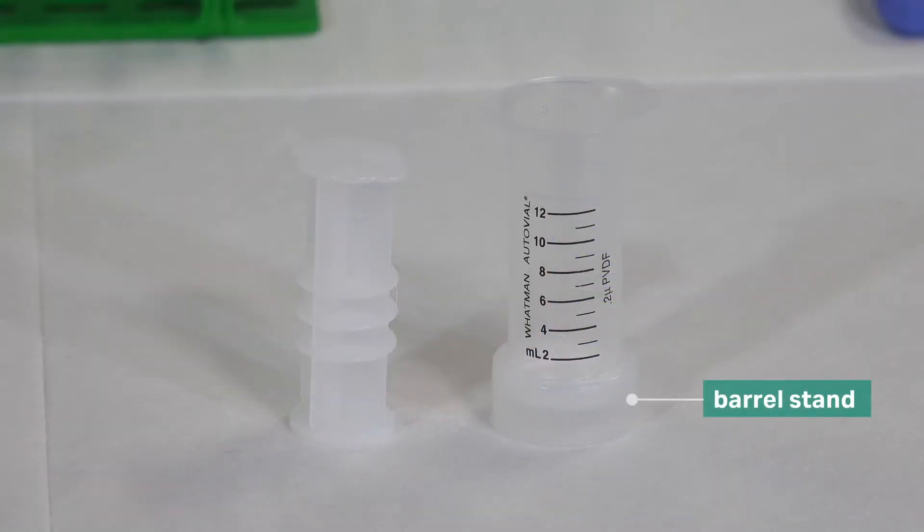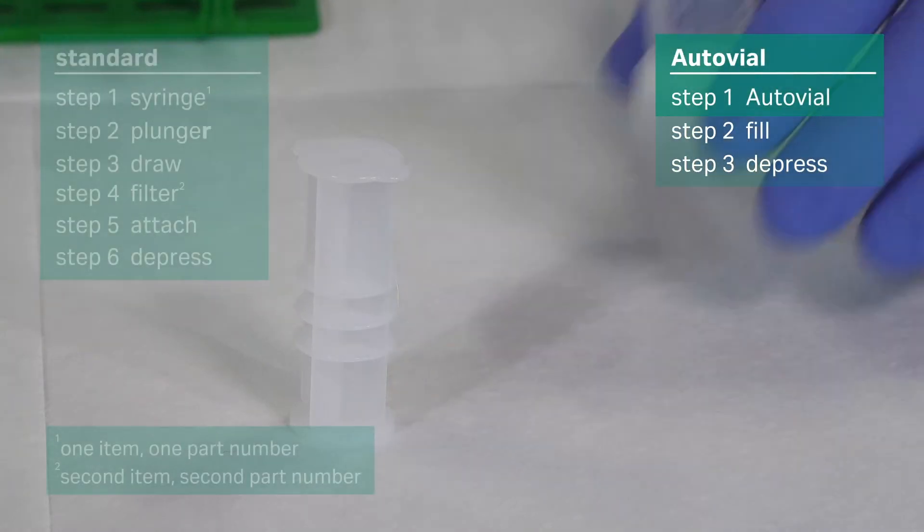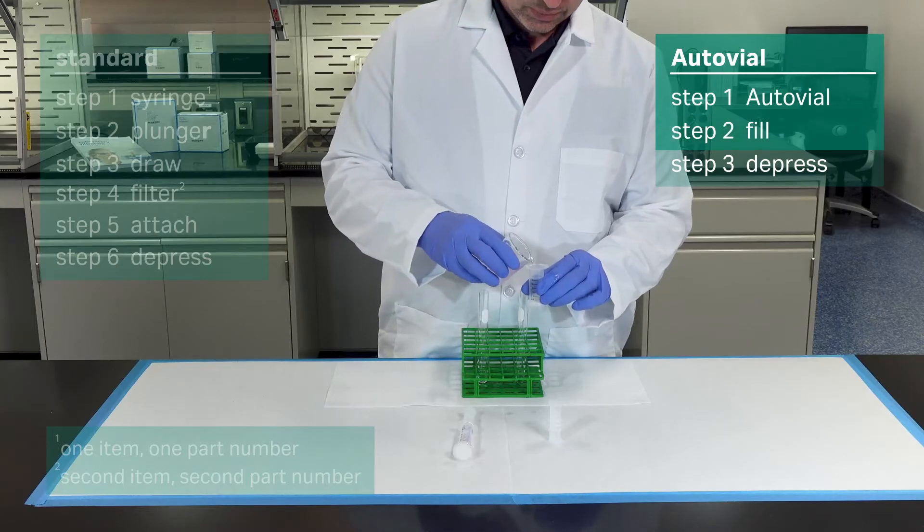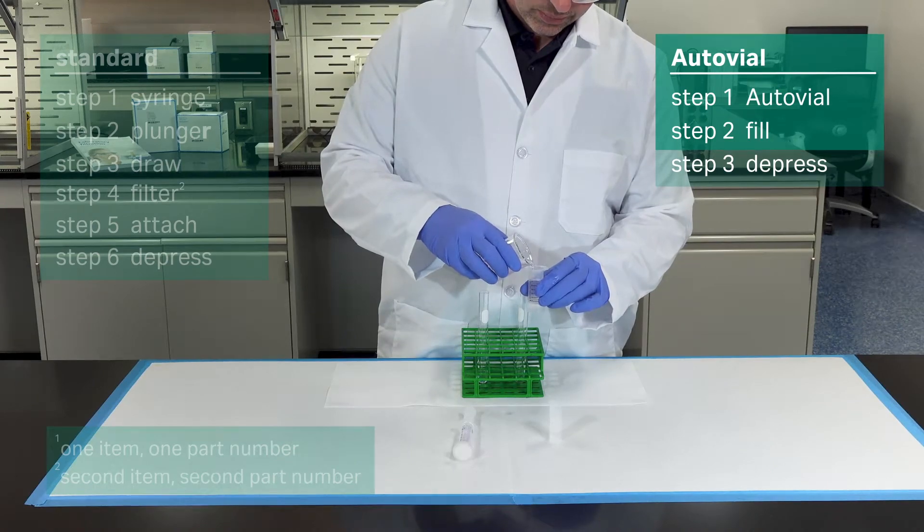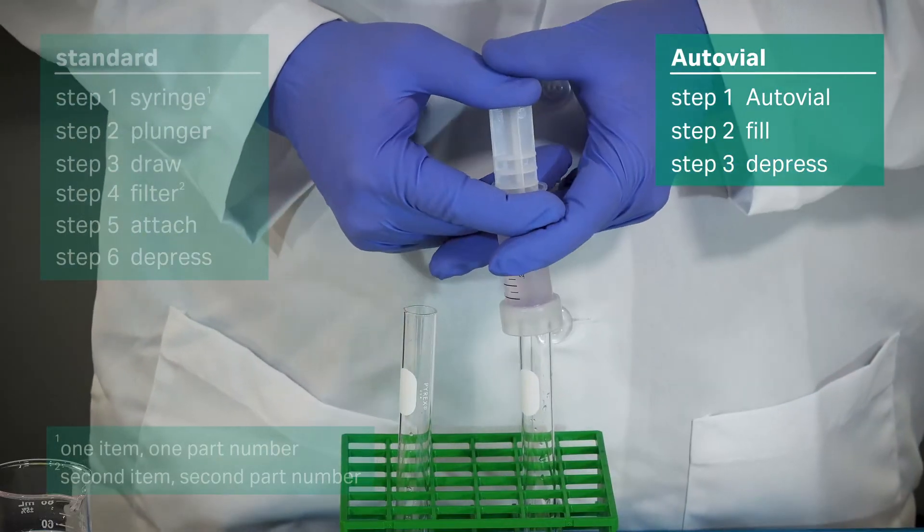It even comes with a handy barrel stand for convenience. Okay, let's start. Retrieve the AutoVial and fill it with your sample. Now depress the plunger, filtering the sample.